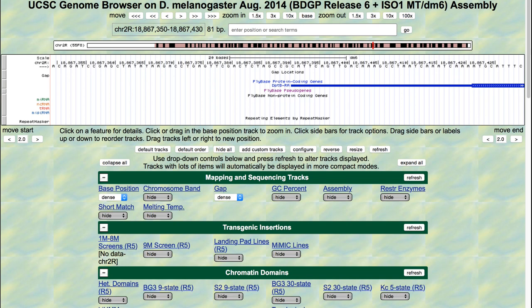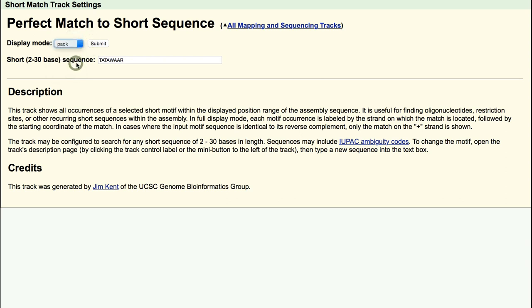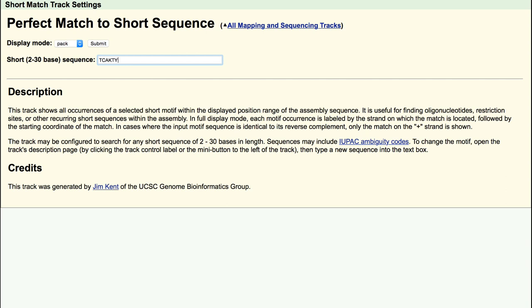To use Short Match, locate the Mapping and Sequencing Tracks section within the Genome Browser and click on the Short Match link. Change the display mode field to Pack and type TCAKTY into the short 2-30 base sequence field.